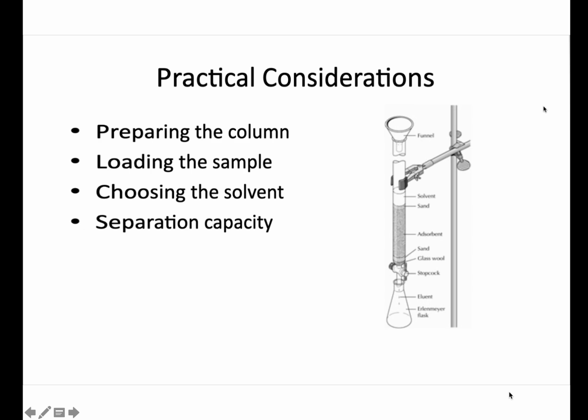Remember, the silica powder never ever must be dried. The silica powder never ever should be dried. So it should be wet and covered by the mobile phase. In order to secure that, always keep the level of the mobile phase 1 inch above the stationary phase.